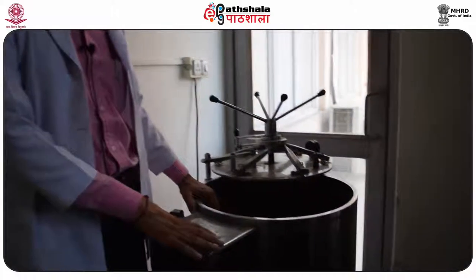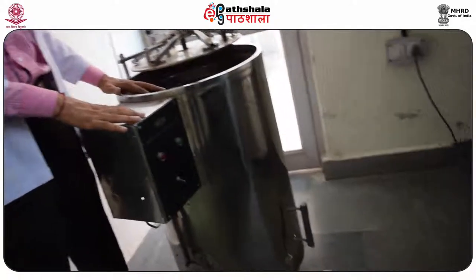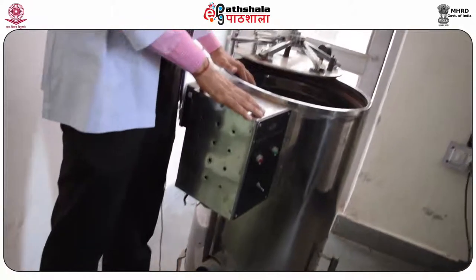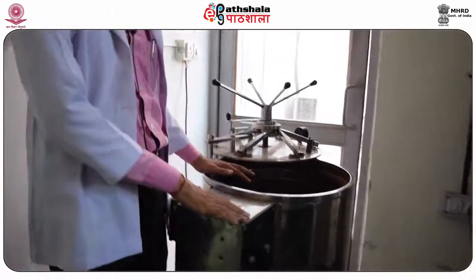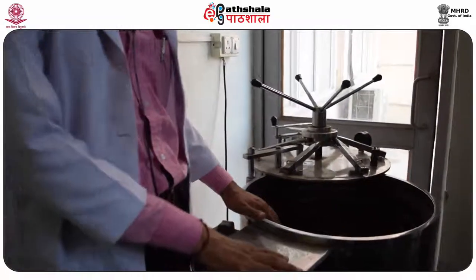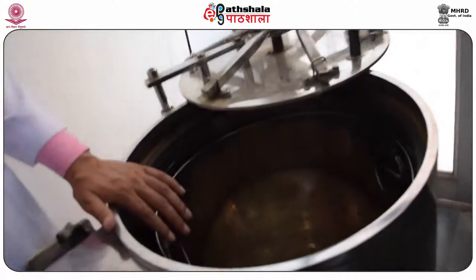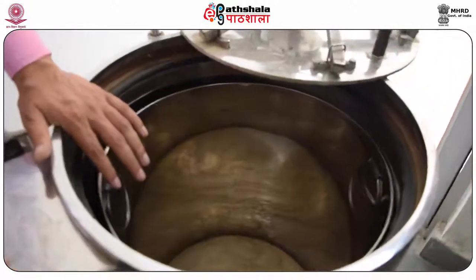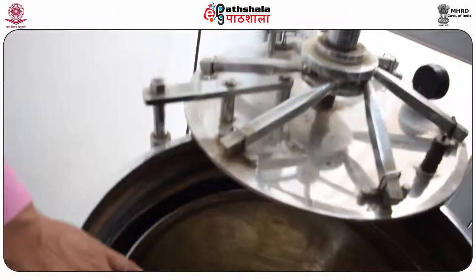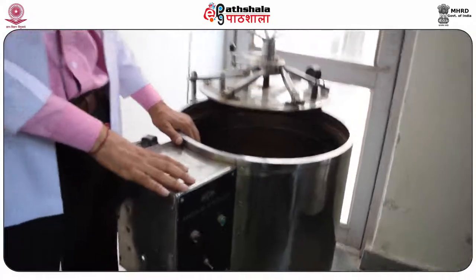So in biosafety level 1, there is no specific requirement of an autoclave, while for biosafety level 2 or higher, an autoclave should be present at the site to autoclave the material and to decontaminate the waste material generated in your laboratory, helping to protect the environment from infections and prevent the spread of infection from the environment.